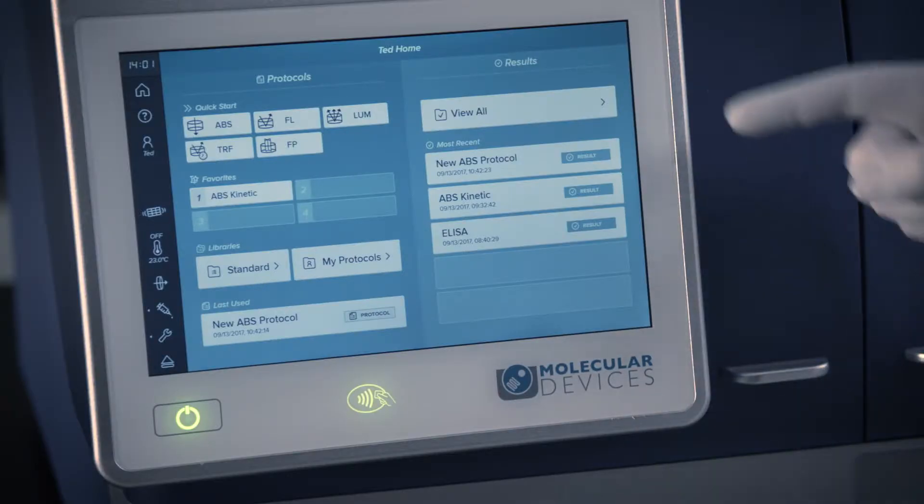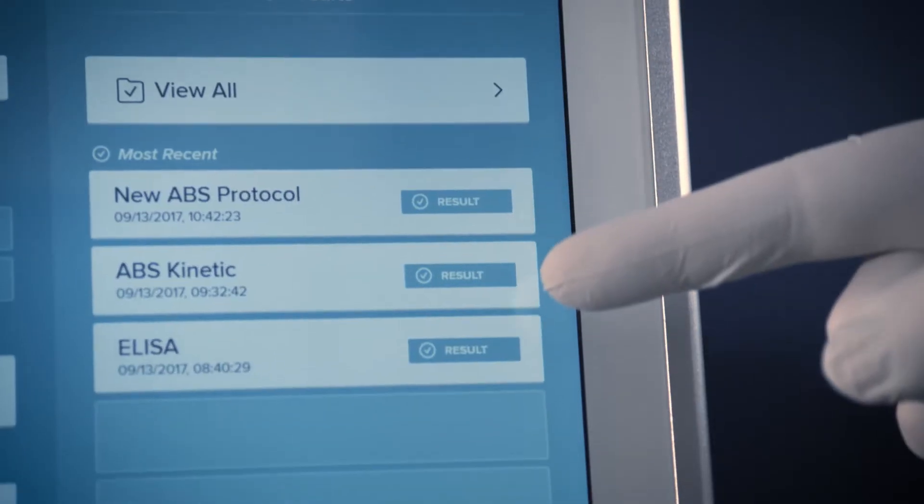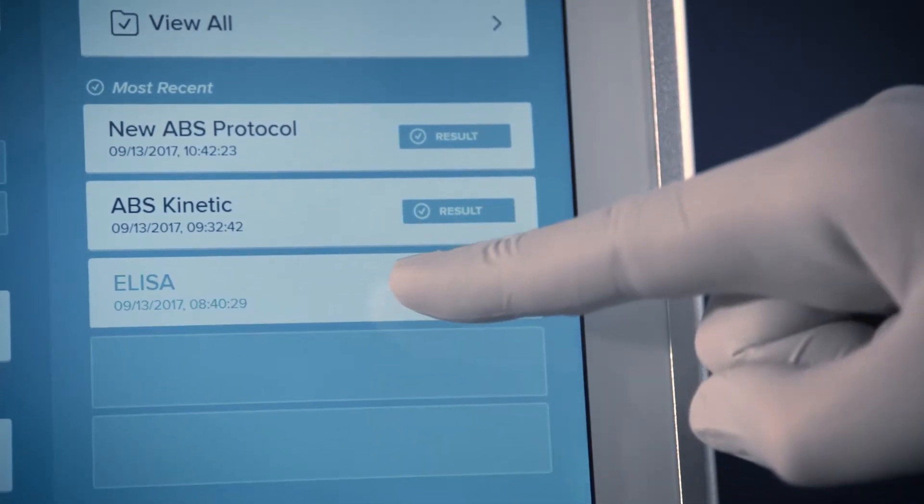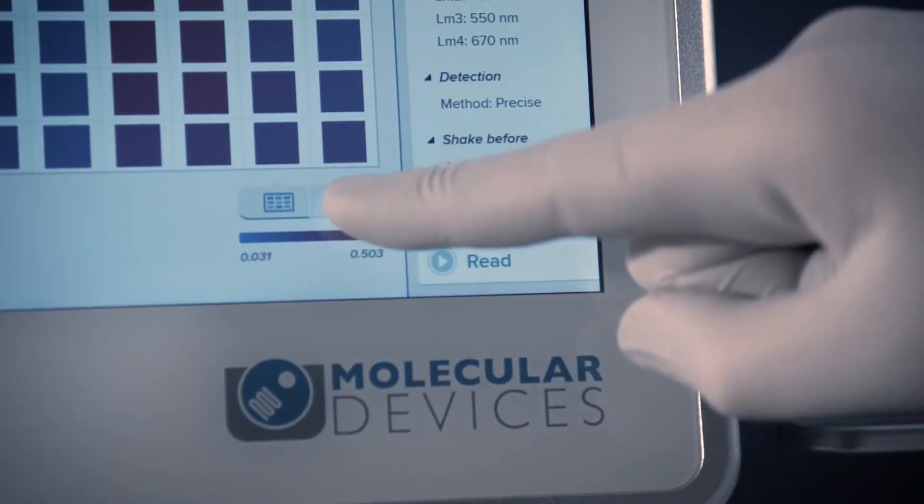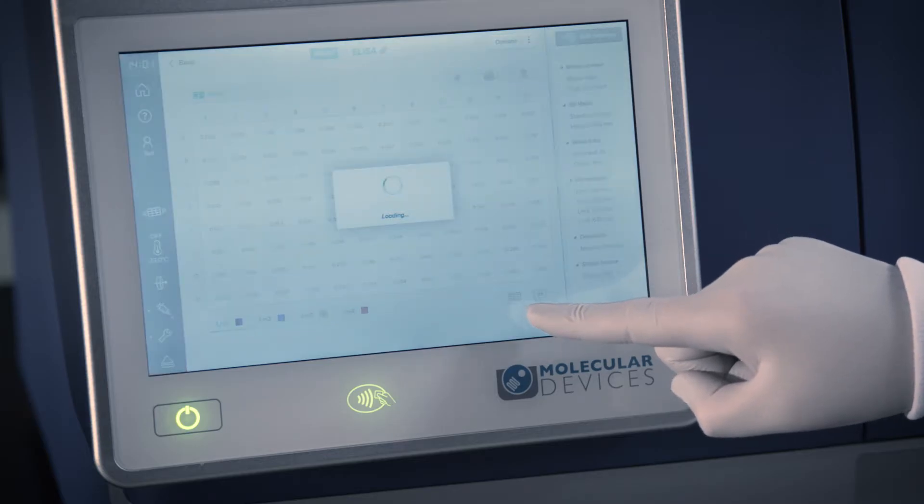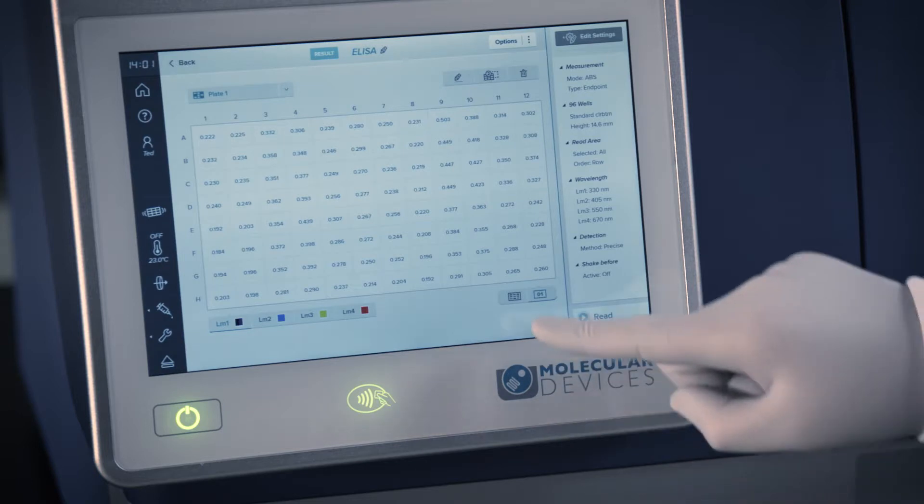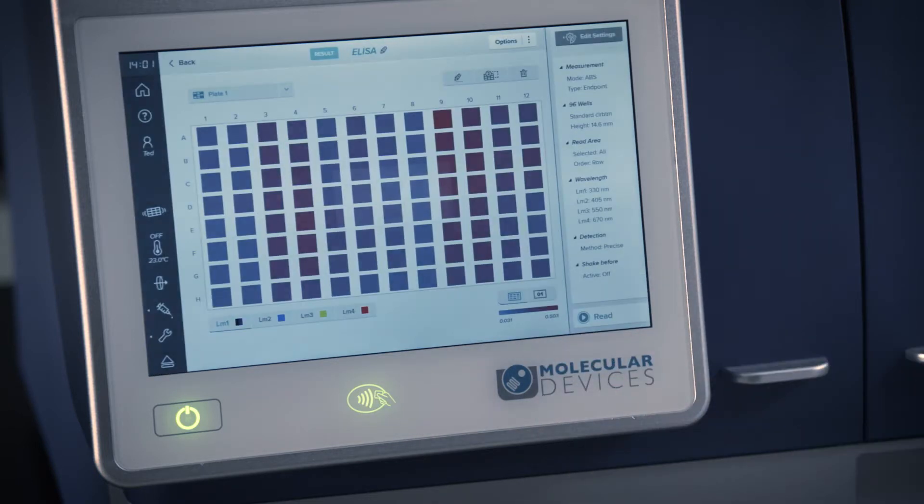After your read is finished, your protocol file will change to a results file. In the results view, you can select between two different view modes: numbers, which will display the raw results of the read, and heat map, which will display the data in color heat map format.